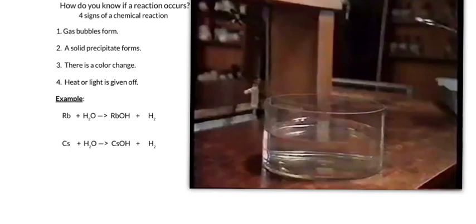Do you think that a reaction occurred? Well, we certainly saw heat or light was given off, and you may have seen some gas bubble formation. This shows us that our elements, rubidium and hydrogen, rubidium is more reactive than hydrogen.